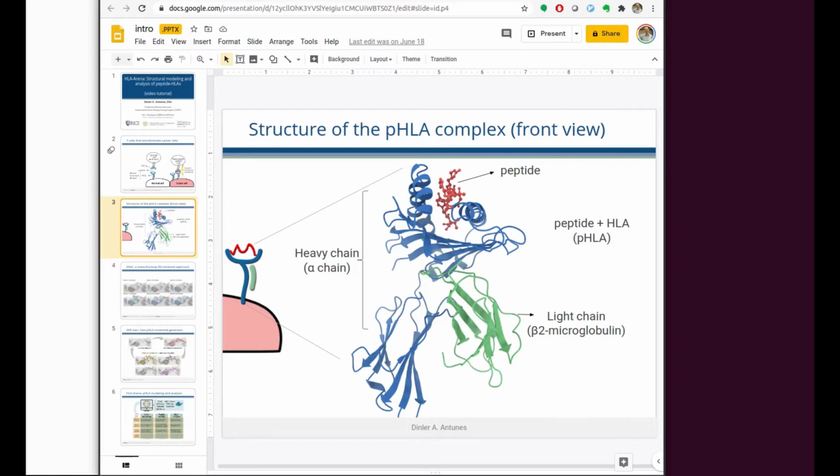The reference computational method to predict the structure of a protein-ligand complex is molecular docking, and there are many different tools that are routinely used for drug discovery. These tools, however, perform best for ligands with up to 12, maybe 20 flexible bonds or degrees of freedom. The challenge here is that peptide ligands can have way more than 30, 40, or even 50 flexible bonds, being too large and too flexible for conventional docking methods.